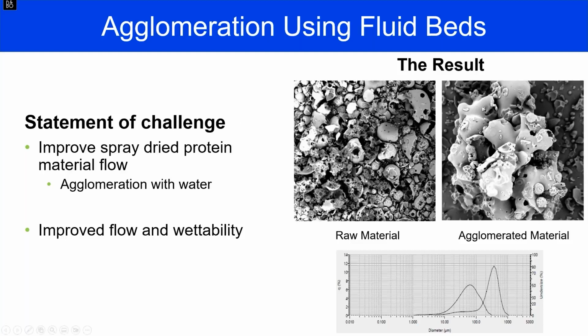When we agglomerated this stuff, you can see the agglomerated particle here, and in one sense, you can say you did make that cluster that you were looking for, that wettability. And that's true, but let's take a little bit closer look, particularly up at the top of the screen. You see how it's kind of rubbed out? What's happened is there's been enough water added to this system that we dissolved significant amounts of this protein and then dried it into not the grape clusters held together by solid bridges, but it looks like we're forming a new structure almost altogether.